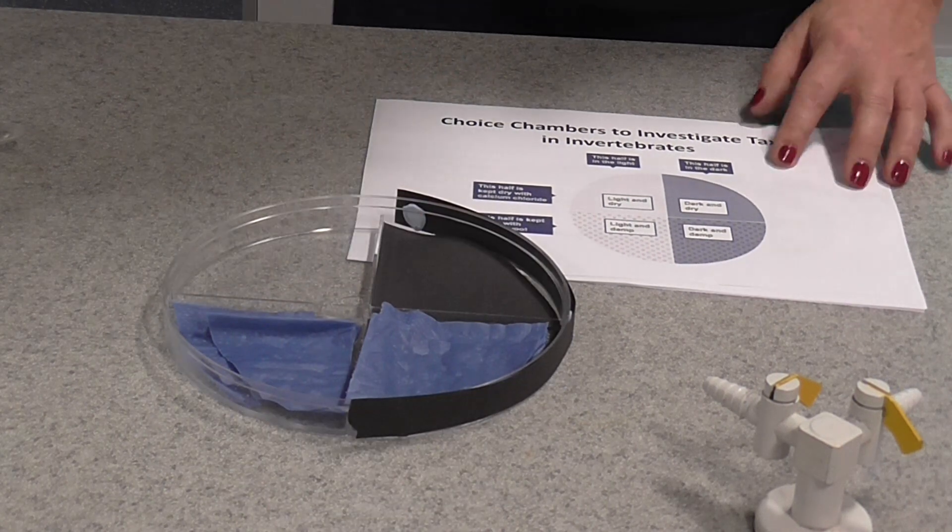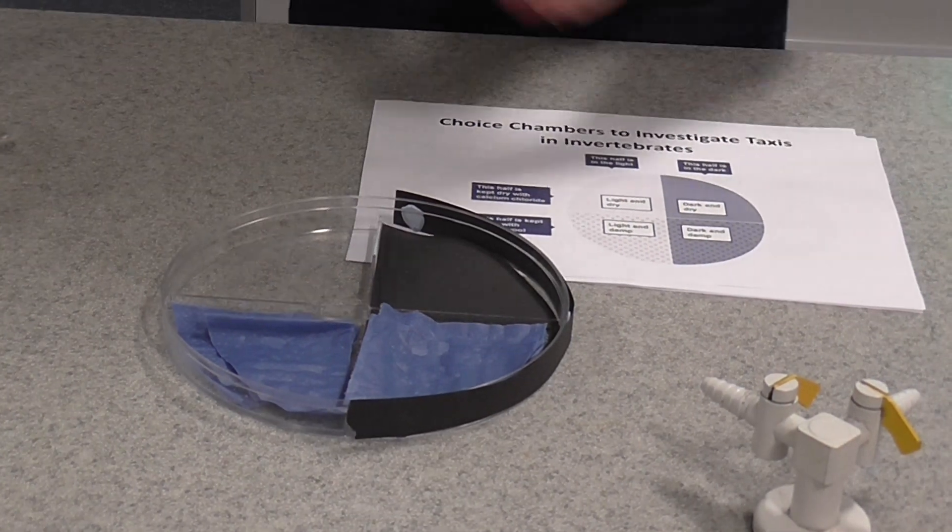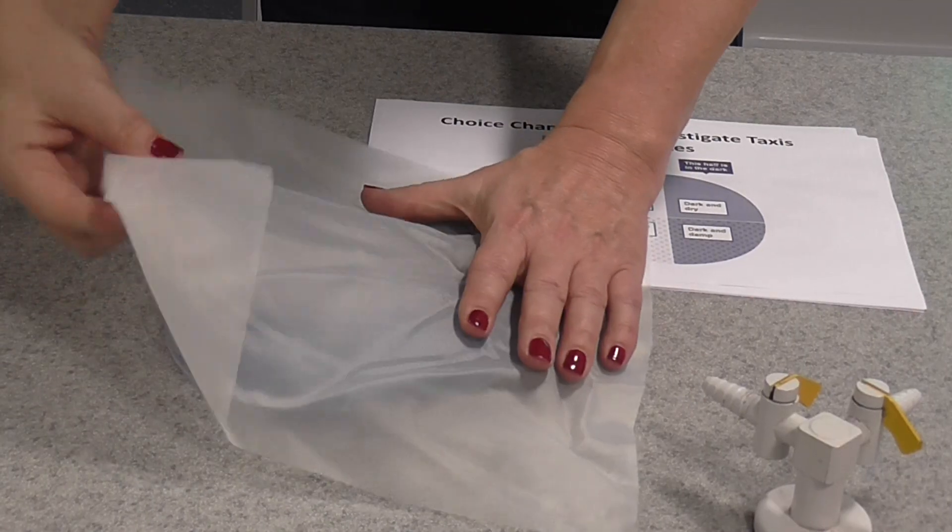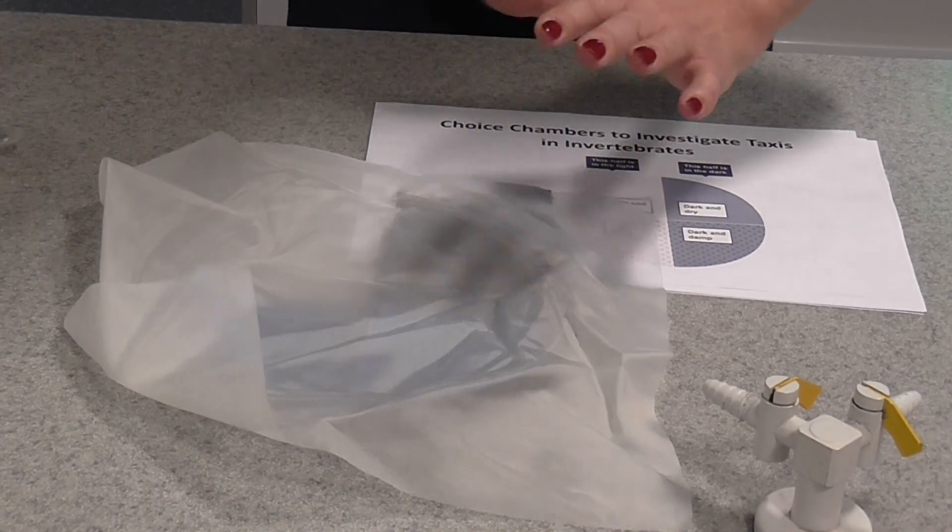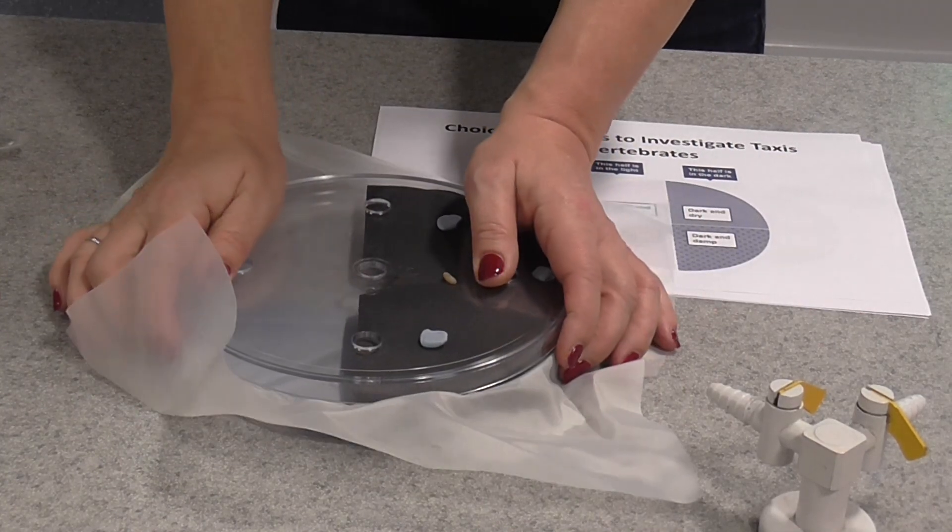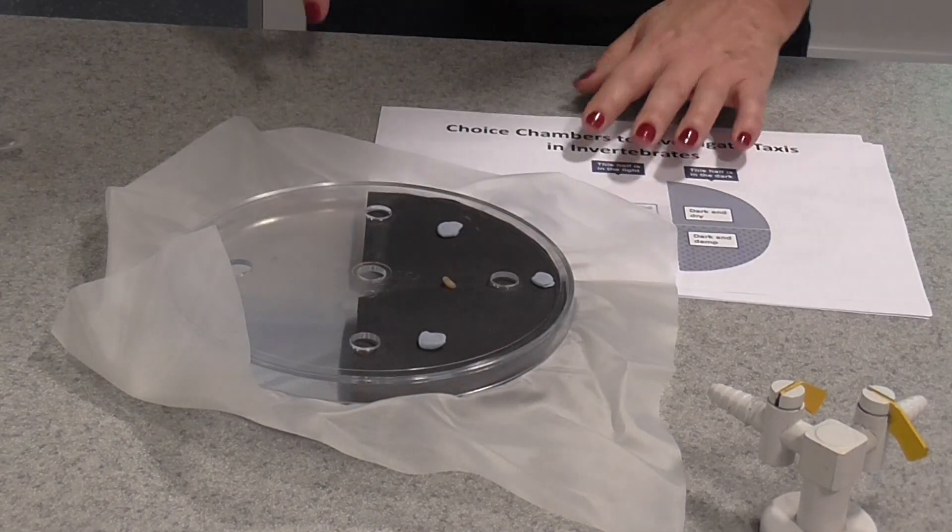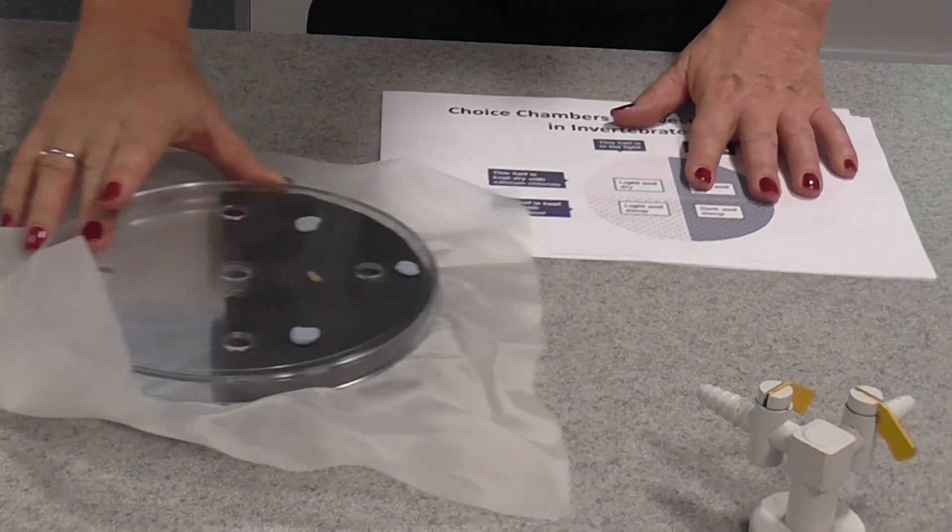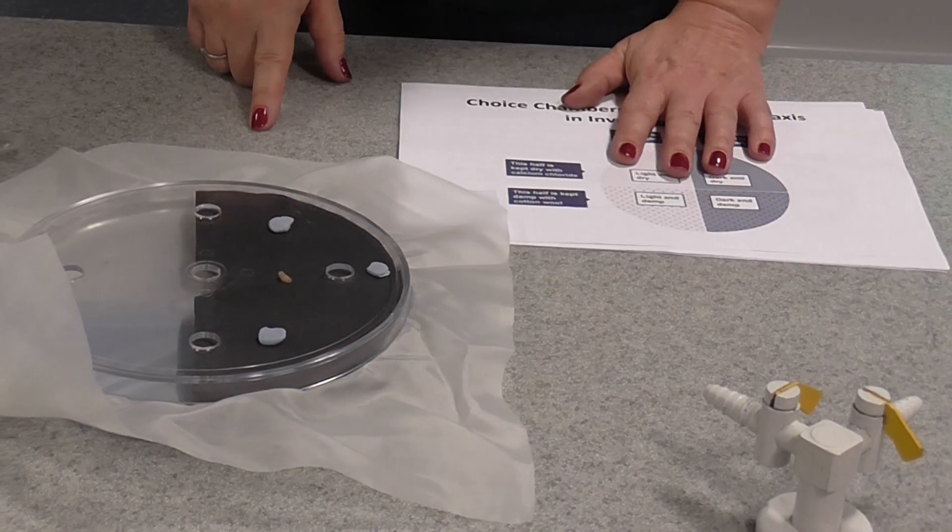So once we've set that up, the next thing we do, we place a thin nylon sheet over there and then we place the lid onto the choice chamber. You can see I've got a little escaped maggot from the last time I did it there. That shouldn't really be there, but we can ignore it.